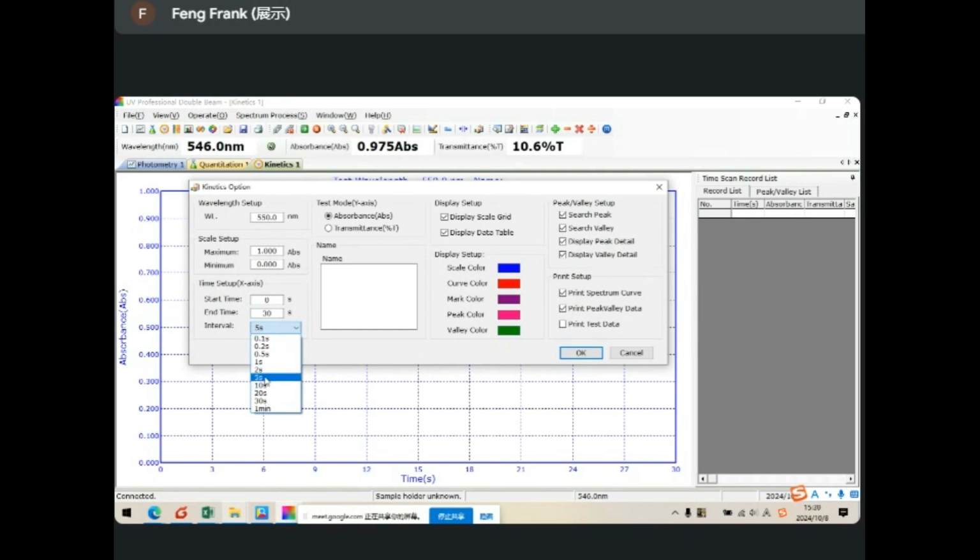Also do the blanking and do the test. After you press the blanking button, it will ask you to select the position. Same steps here. Also, first press this button, then close. Press this one, then close.